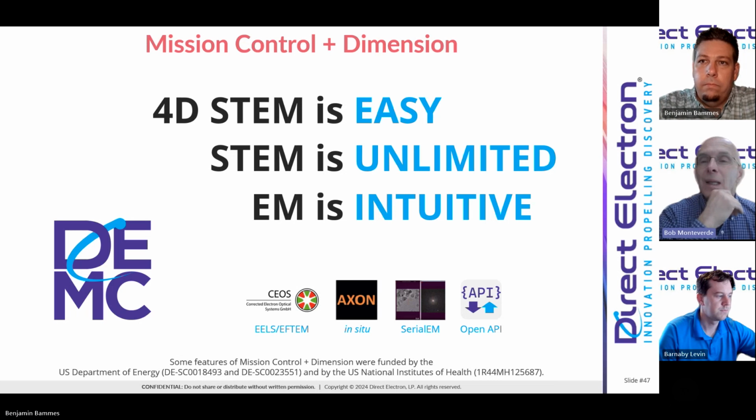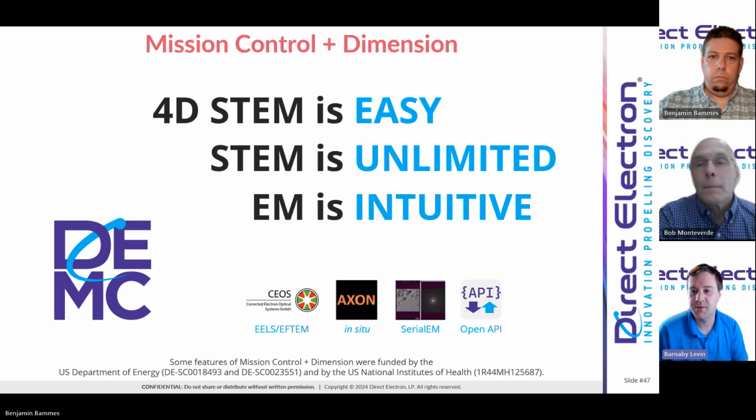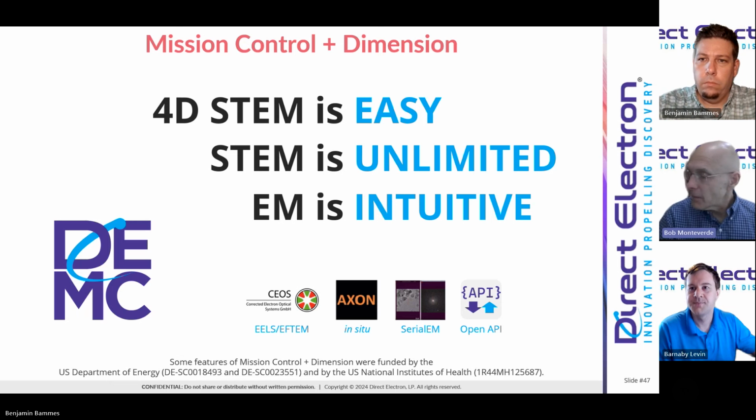A question came in about the metallic glass mapping. How was that data processed for the metallic glass mapping? Yeah, so that data was processed by Carter Francis, who's a graduate student in Paul Voyles' group at the University of Wisconsin-Madison, which he did using HyperSpy and py4DSTEM and his own custom Python scripting. I guess the point to make there is our data is designed to be saved in easy-to-read open formats, HDF5-based formats. So that allows people to import the data into those open source 4D STEM programs and do their own analysis of the data. Thanks.